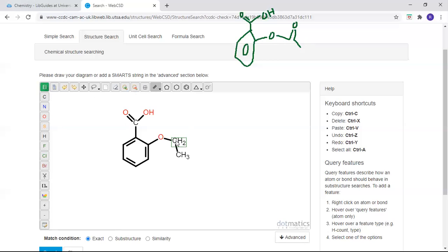See how the green square around the CH2, you click, you drag, and now we put an oxygen. And then we do the same for hydrogen. It's a single bond around these. So we just add single bonds, then we're going to put hydrogen on the tips. And so this is what your acetylsalicylic acid should look like.